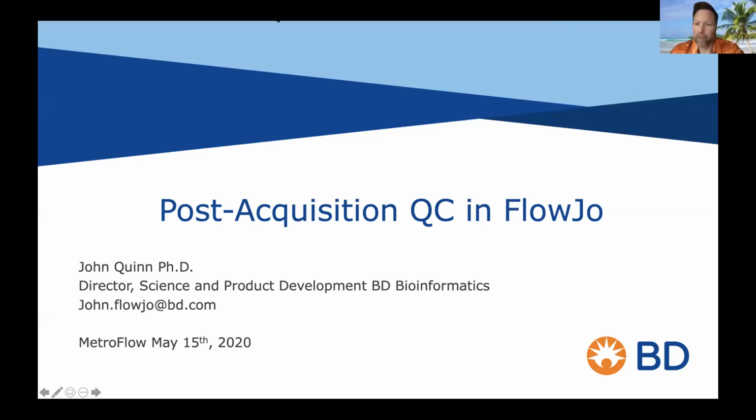All right, I'm going to stop my lovely Hawaii video for the time being to give more bandwidth to what's going on here. The idea is I will spend about half the time with some slides, and then I will demo everything that I'm going to talk about in FlowJo, because I think it's always a good idea to show how to use the tools that I'm going to advocate for.